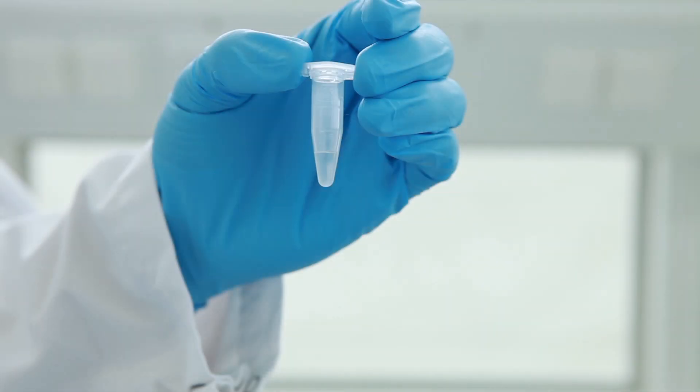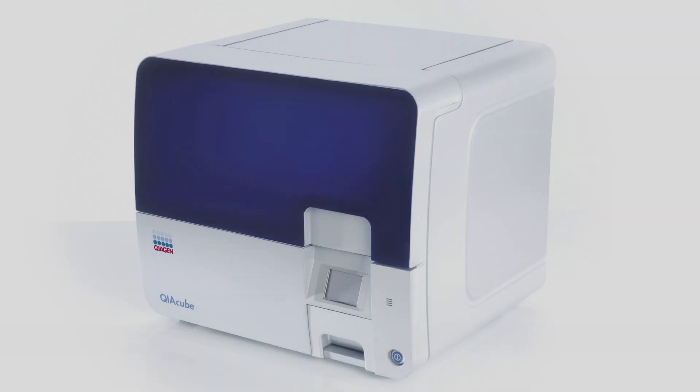The purified DNA is free from PCR inhibitors, enabling sensitive detection in standard, multiplex, and real-time PCR and sequencing. All steps in this visual protocol can be fully automated on the QIAcube. Up to 12 samples can be processed simultaneously. You can download the DNeasy Blood and Tissue handbook from our website.